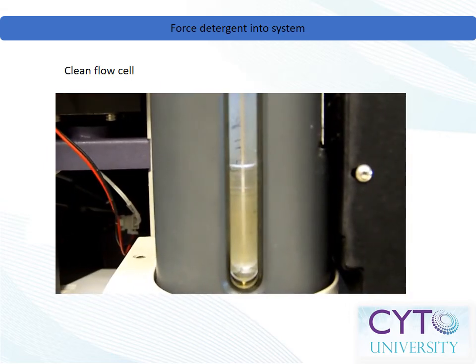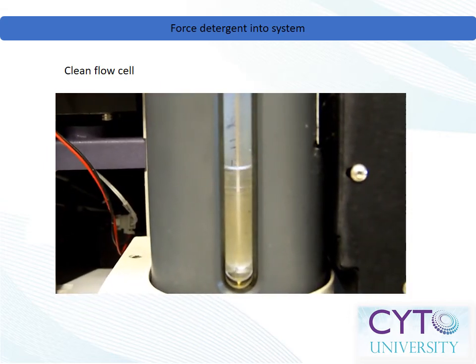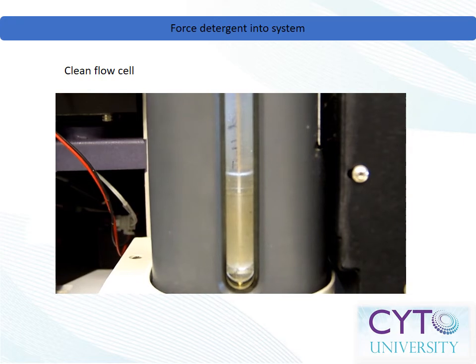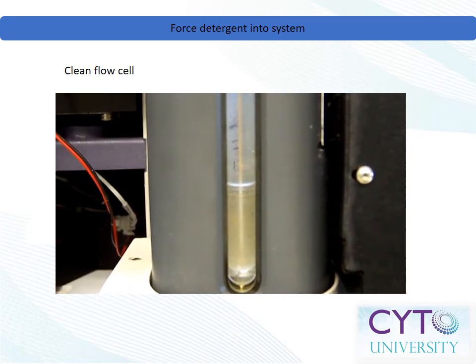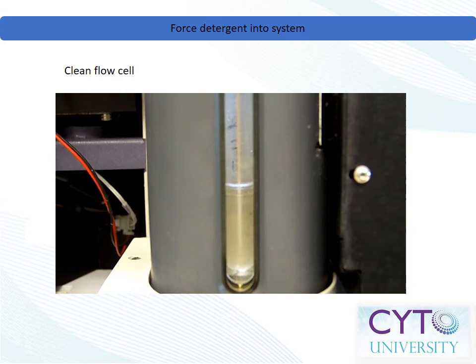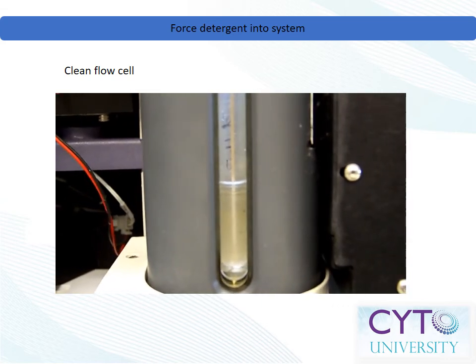Some systems have software programs which force cleaning solutions into the sample injection tube. Note that the cleaning solution is visually depleted from the sample tube as the sample path fills with liquid. Upon satisfactory cleaning, it is always important to rinse away any detergent residue from the sample port using copious amounts of purified water. It is especially important to do so prior to loading samples back on the instrument.